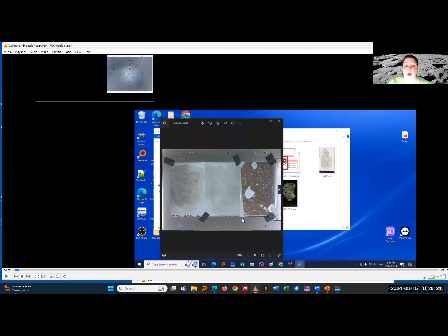scan. And so one of the amazing things to me when you have both PictureSnapApp and PictureSnap on your computer is that both run happily alongside each other. So you can have both open at the same time, and you can use both to navigate or to track the other one. And that makes calibrating any other images, specifically if they are smaller, if they are shorter, really a breeze. And this is what I'm trying to show here now.